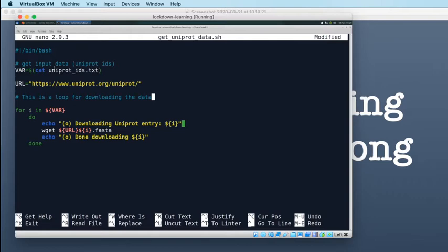So that's what this does at the moment. We know that's what it does because we used it to do that on Monday. What we want to change, therefore, is after we've done the loop, we want to run muscle. So we're going to run muscle down here.